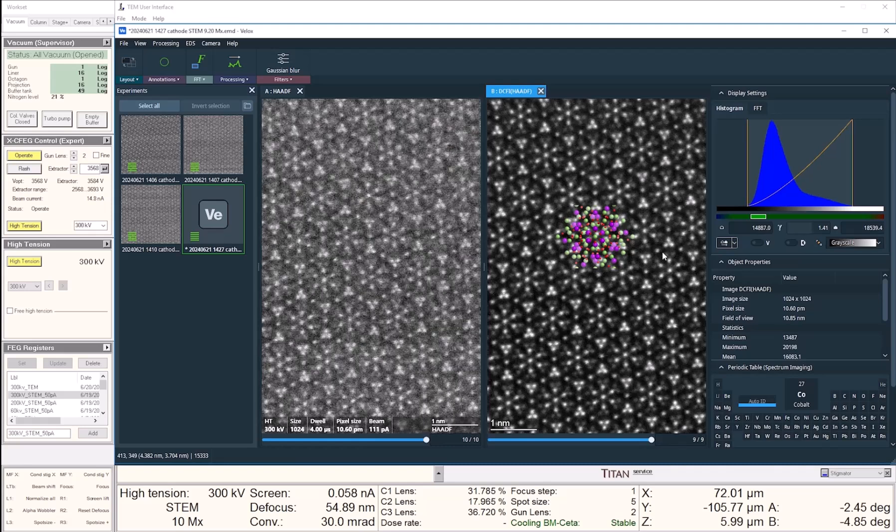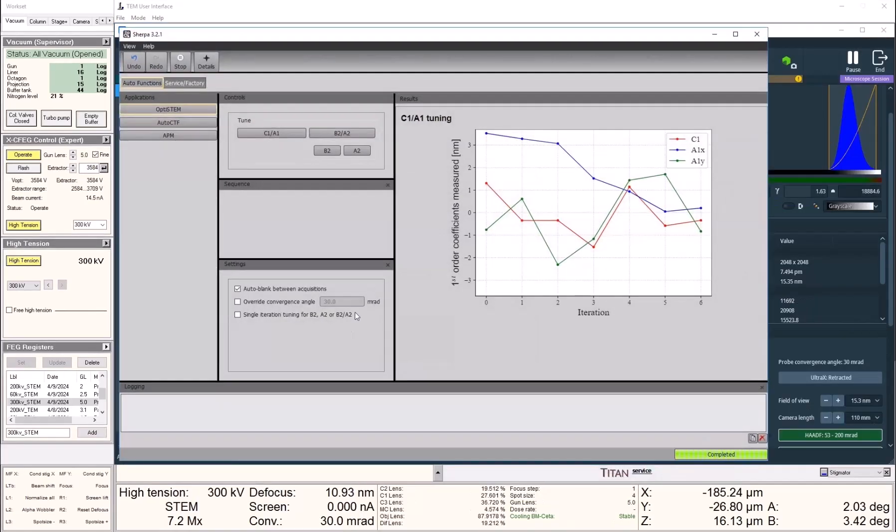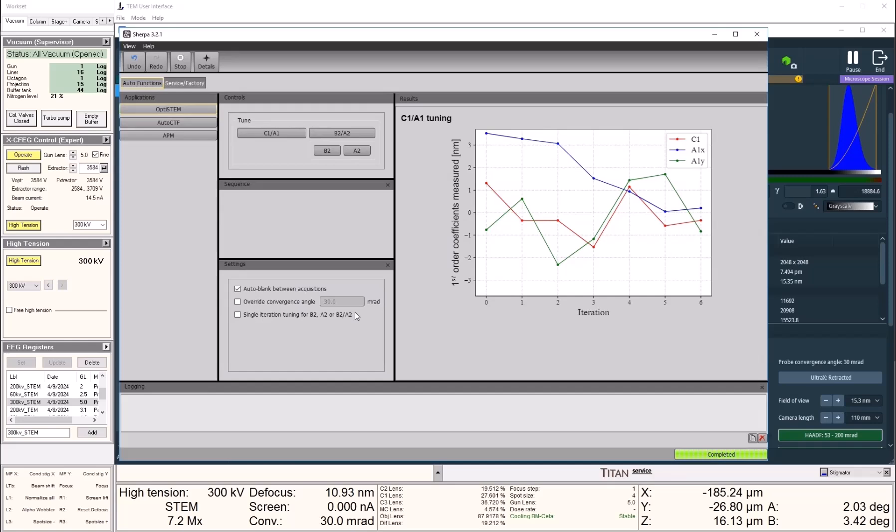But this is not everything that OptiSTEM can do. For more advanced users, OptiSTEM also lives in our automated function platform Sherpa, and here it's even more powerful because it can also correct for second-order aberrations, namely B2 and A2, the 3-fold astigmatism.